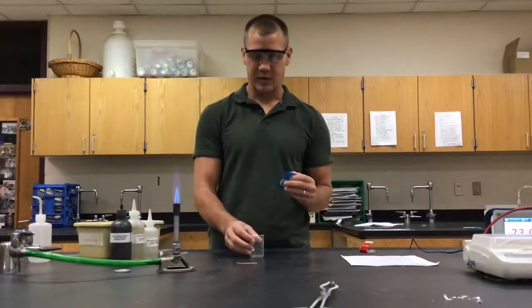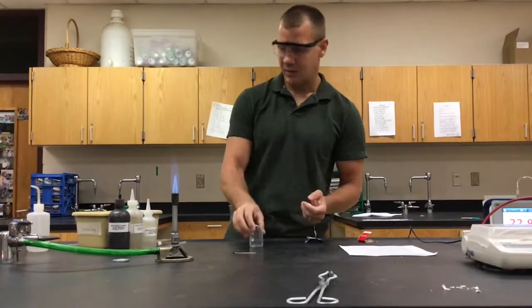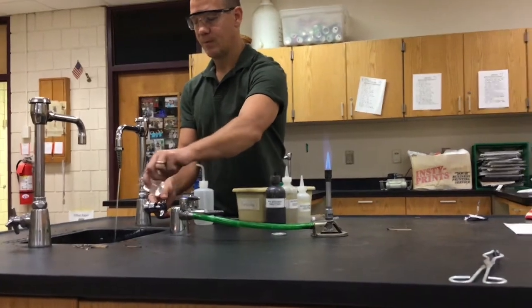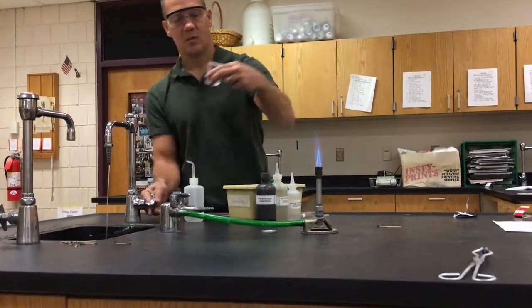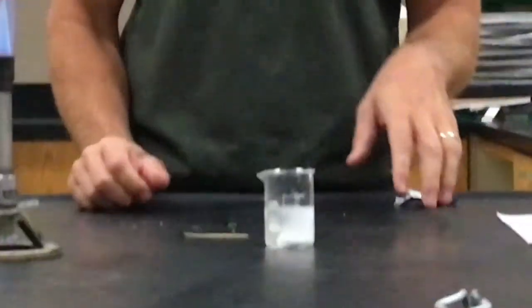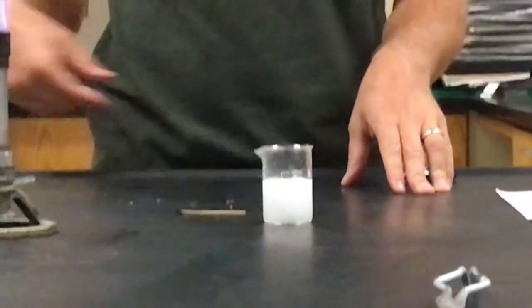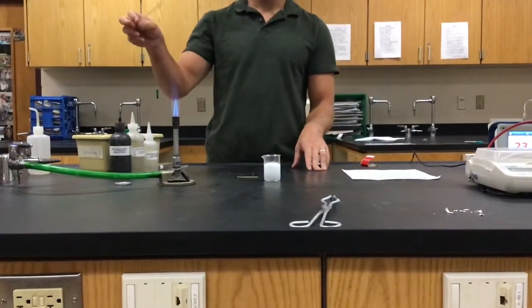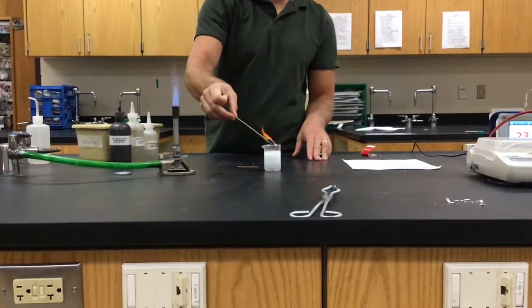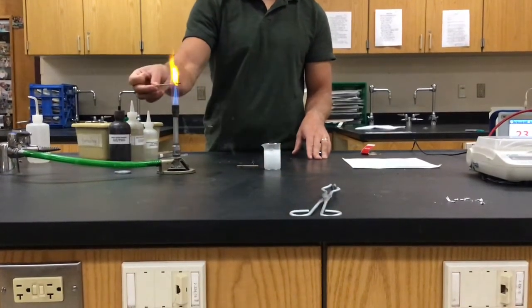For this next one, we're going to drop an Alka-Seltzer tablet into some water. I've got an Alka-Seltzer tablet and I'm going to get some water right out of the sink — about that much is probably appropriate. We're going to drop the Alka-Seltzer tablet in and you can see some bubbling and fizzing. Just like the previous one, we're going to check for the gas with a burning wood splint. You'll notice that the burning wood splint goes out as it approaches the top of the liquid.